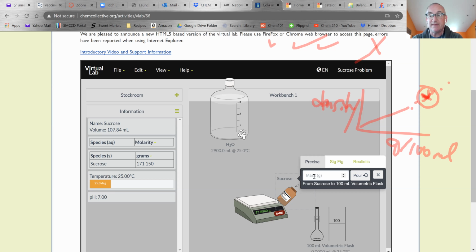So Jovan points out, is the slope going to stay the same? That is something that you don't know, and that is why you can't use that. In this instance, you probably could, because I think there's going to be a direct relationship between density and concentration in a straight line all the way until you get to a supersaturated solution where you can't add any more solute.